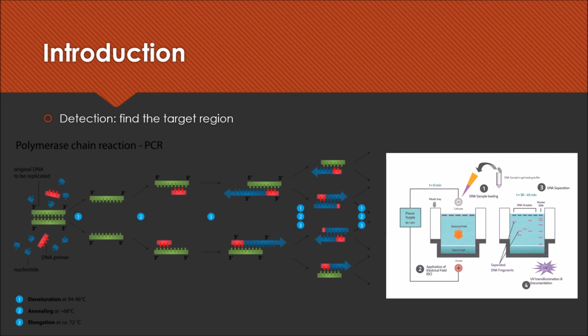Then DNA polymerase, an enzyme, will use these primers as a starting point to build in nucleotides and so copy the DNA. In the second cycle here, the wanted product will be formed, and then in the next PCR cycles, this specific DNA sequence will be copied many times. After the PCR we can load it on an agarose gel, and then we should see bands at the expected size.